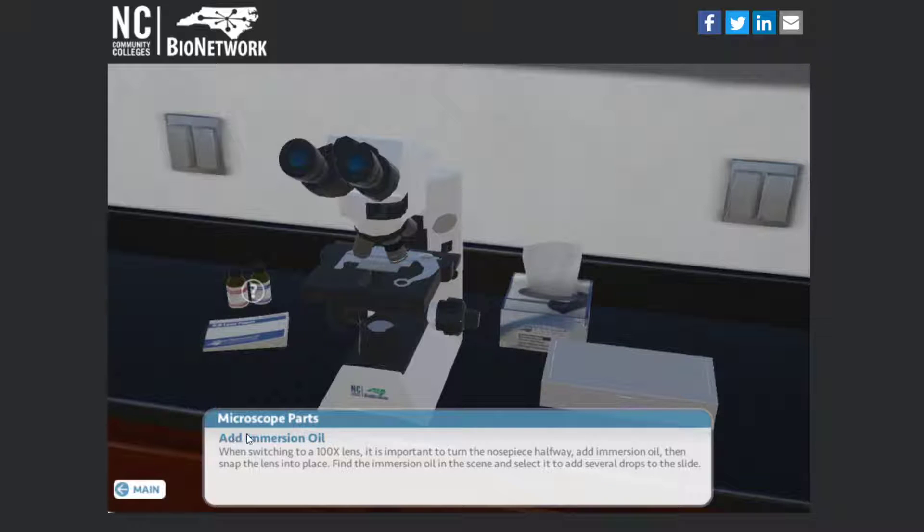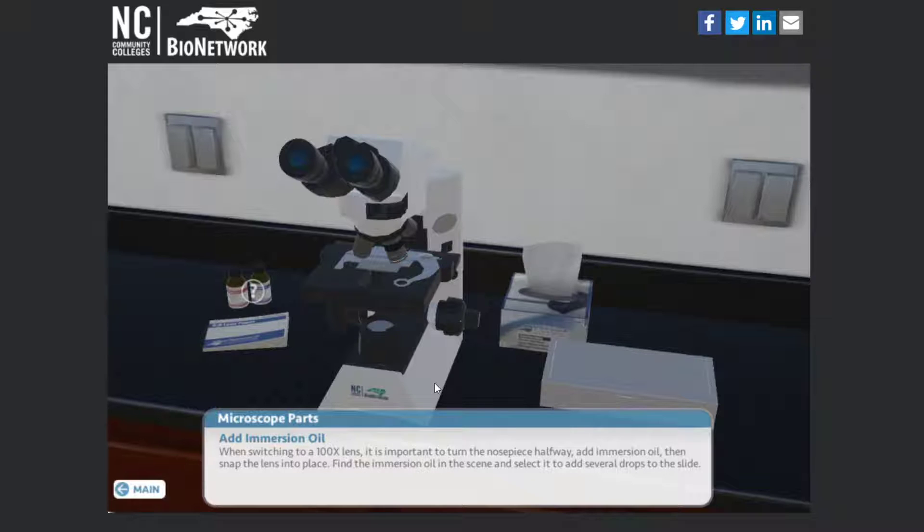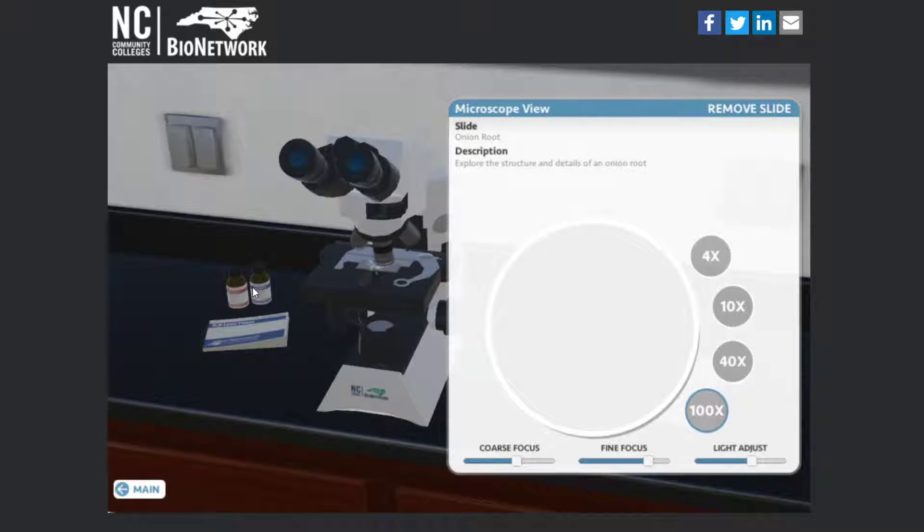At this point it says that you have to switch to immersion oil. You can't look using the highest power objective without the oil. It's not gonna do you any good. So it's gonna prompt you to add immersion oil, and that's over here.